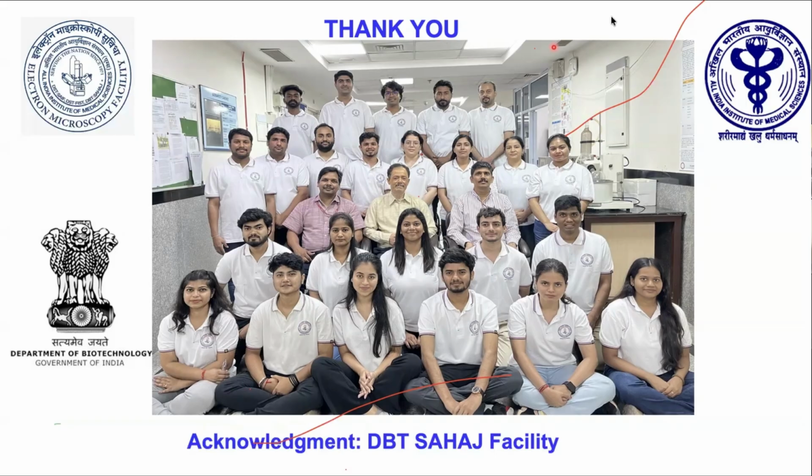I have a follow-up if I can. I was wondering about processing and compute. Is it available, or can you give remote access to people who collect data so they can process it, or do they have to be present at the center? The best practice is that the user is present. At the time of imaging, we assume that users should be there because the user is the master of his own samples. It's not like a simple technique like SPA, single particle analysis, where anybody can generate the data.